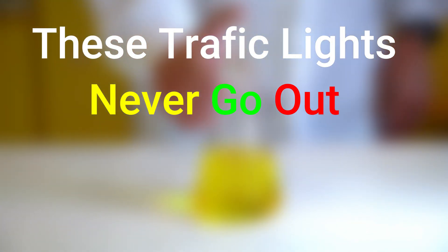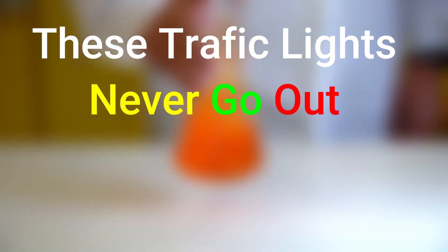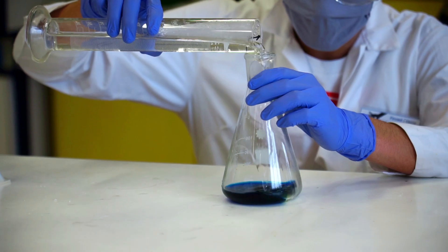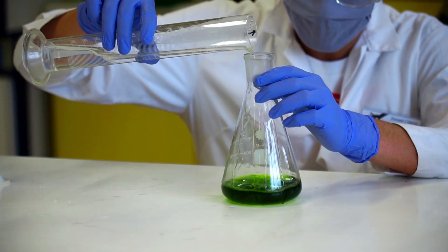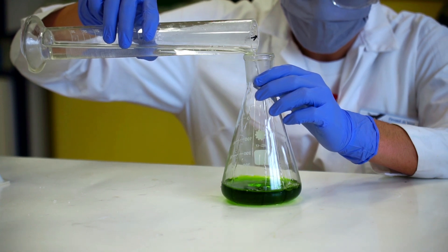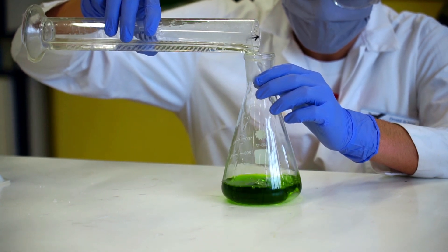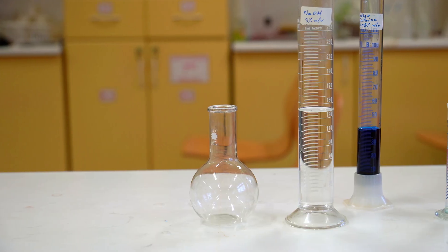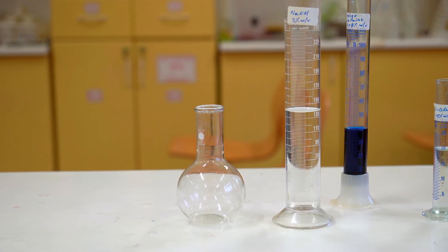Traffic lights is one of the most popular experiments because it is counterintuitive and involves multiple color changes. It's not always a success because that depends on several factors like oxygen availability, concentrations of reactants and temperature. Here you'll see a protocol that never fails.